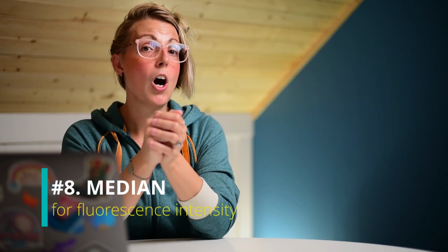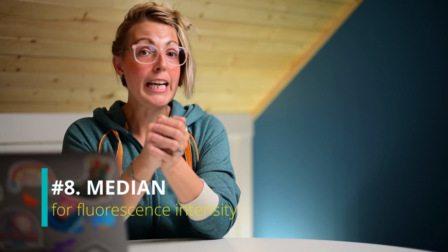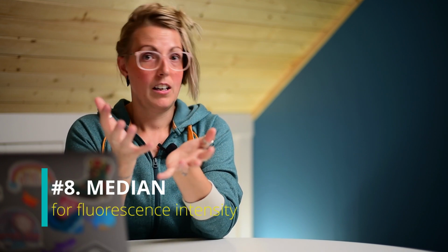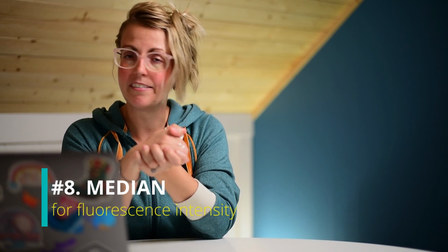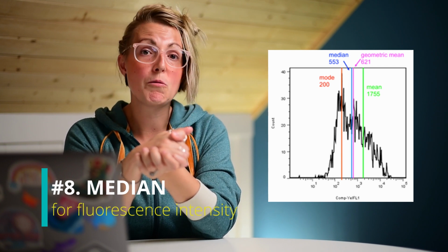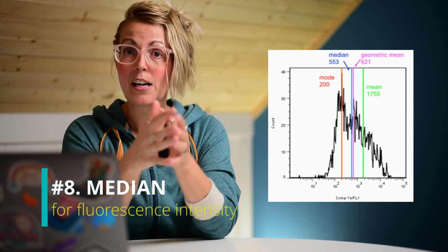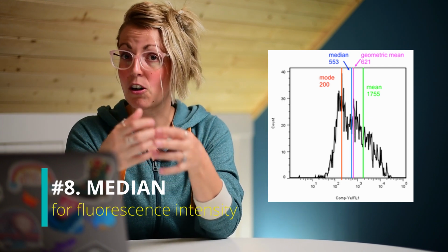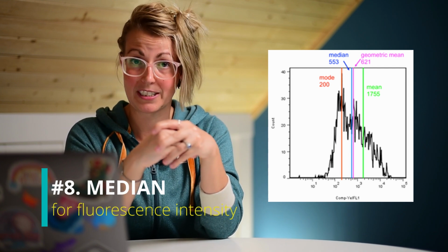Tip number 8, always use median to look at fluorescence intensity. In many papers, you may see MFI presented. If you're using this, always make sure you define what the M is, but in your experiments, the M should always be median, not mean. When working on a logarithmic scale, mean is not going to be representative. It will be very subject to outliers on either side. Median or geometric mean are much preferred to mean when looking at fluorescence intensity on a logarithmic scale.